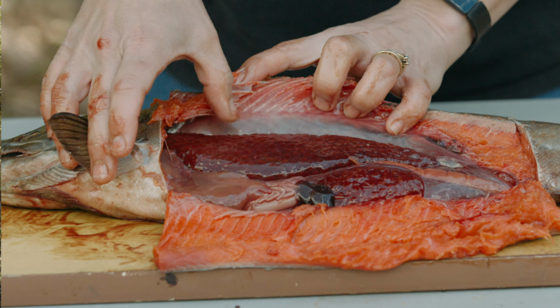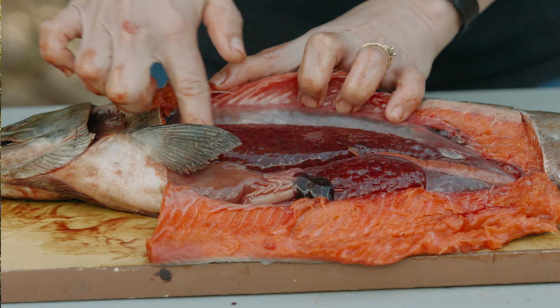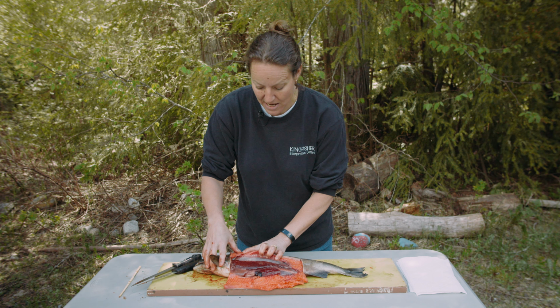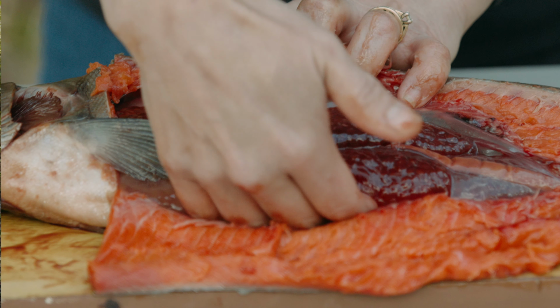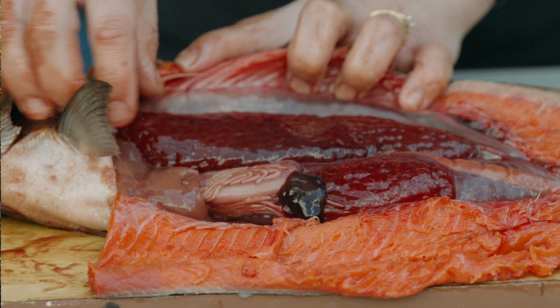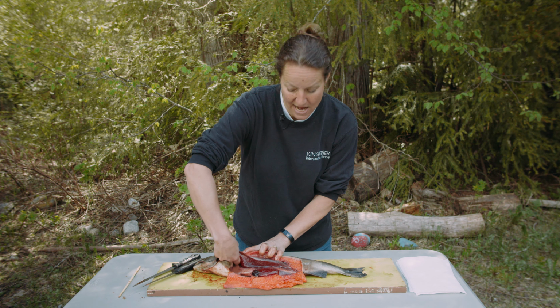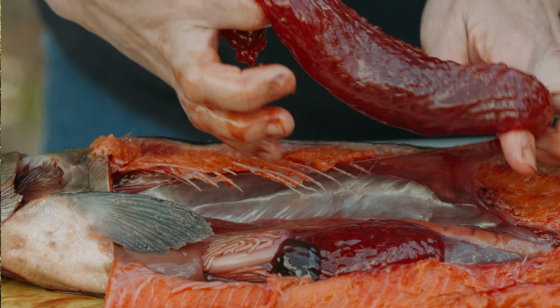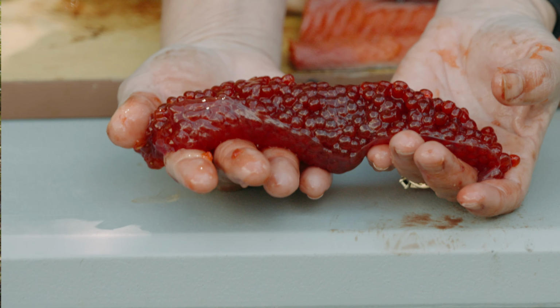And there. Boys and girls, can you see those eggs? See all this right here? Those are the eggs inside of this fish. And there's one batch of eggs right here. And there's another batch underneath on the other side of the fish. Now I'm going to remove these eggs one skein at a time. There are 2 skeins. And there we go. So there's 1 skein of eggs.